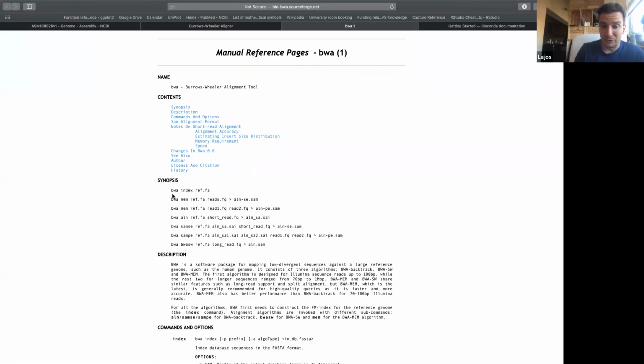So you have to index your reference sequence. This is how you use BWA. It's the same kind of process as what we did with bowtie build. It will do some kind of indexing on the reference sequence, and the index file will be there. Probably it's just another file with the same file name but a different extension from your reference sequence.